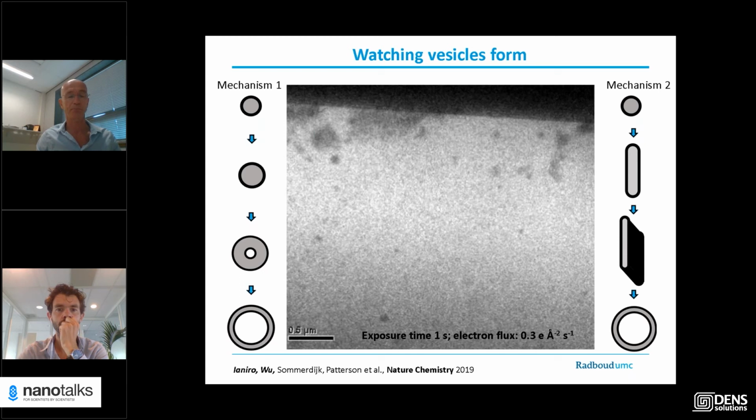Yes, exactly. I understand. So with direct detection electrons and a powerful microscope, it's possible. We also work with a very old microscope, and we work in diffraction mode. With that, we can reduce the dose and increase the signal to noise ratio as well. Yes, thanks for answering.